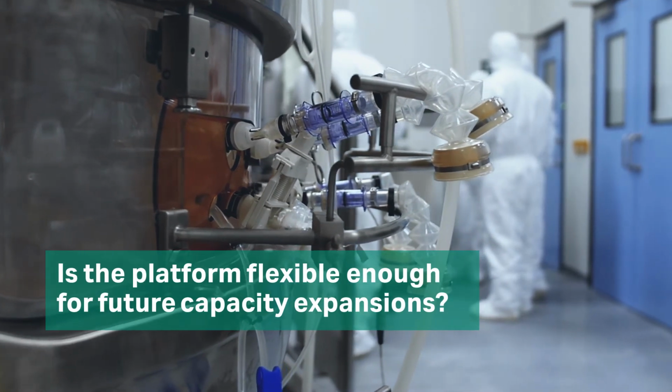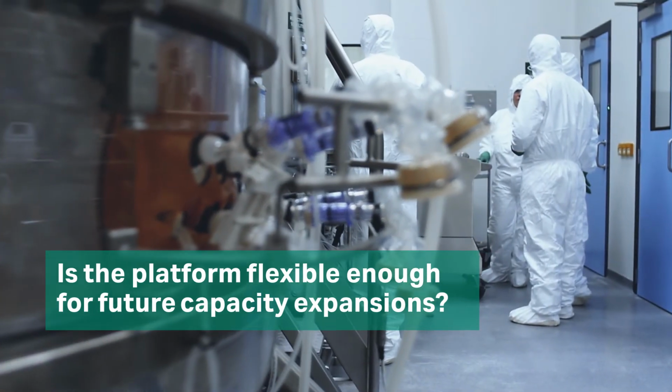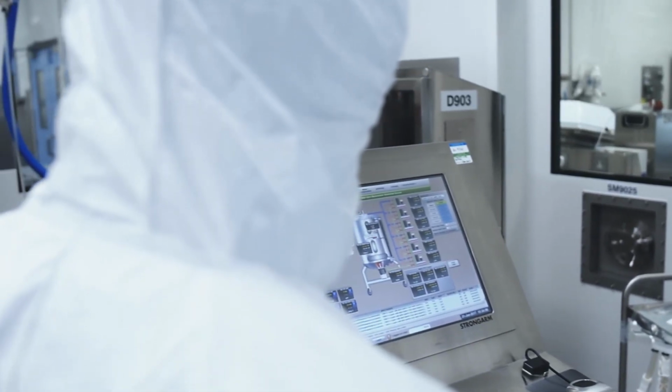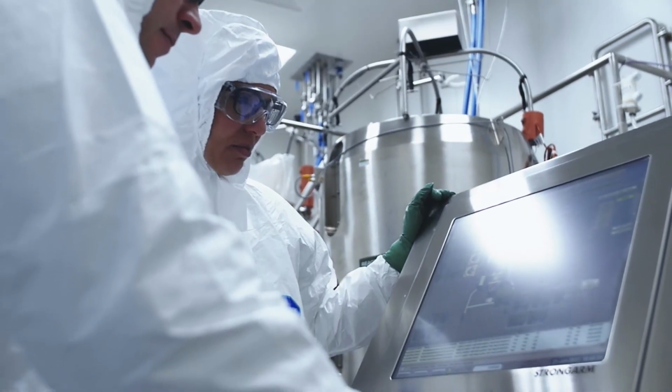We looked very closely at the capacity of the assets in RTP. They had a range from small scale through to 1,000 litre, and then they also added in 2014 the 2,000 litre bioreactor. This gave them the ability to serve customers right the way through the clinical cycle. Having looked at that, we thought, well, this is probably a good idea to emulate it, have a mirror image if you like, because that would give us the ability to build on the experience they had and also to flex by moving customers from one site to another as assets became free, as well as serving the full clinical cycle.